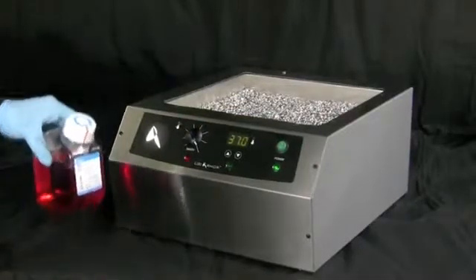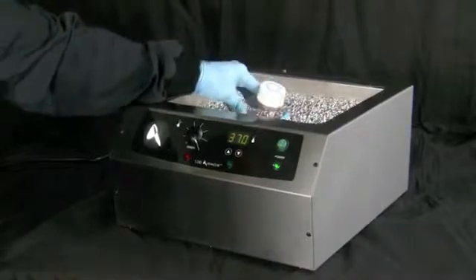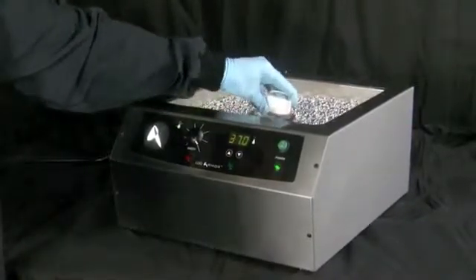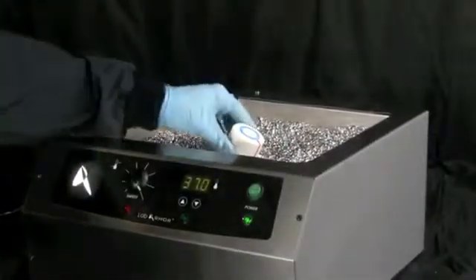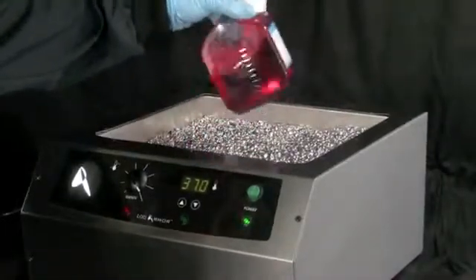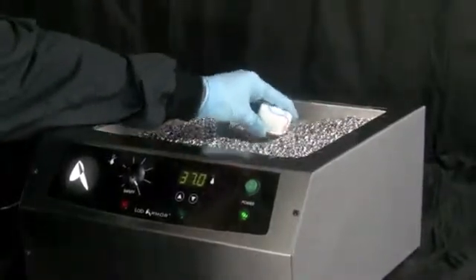For thawing, bring frozen vessels to 4 degrees centigrade in the refrigerator, or just prior to immediate use, bring the sample to room temperature on the bench top before placing in beads to reduce incubation times. Periodically agitate larger cold vessels and relocate to warmer zones in the bead bath, and when possible, fully submerge vessels in the beads.